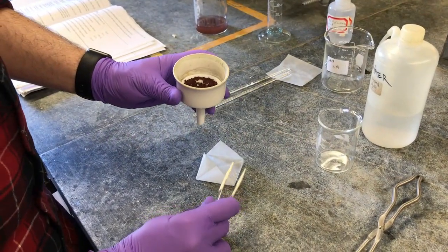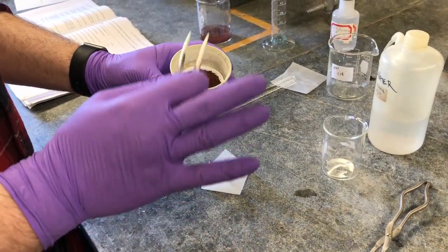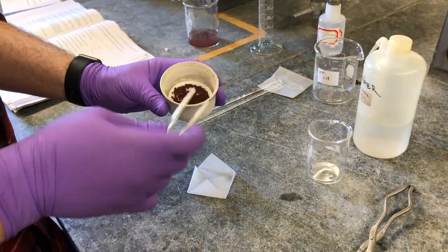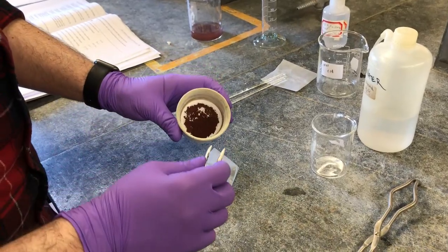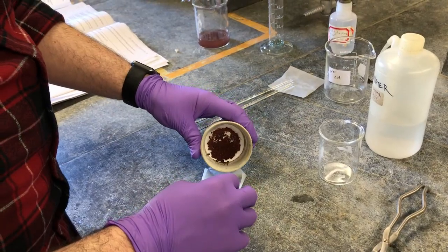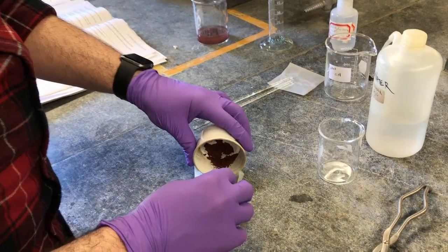All right, so we've let this dry on the aspirator for about 5 minutes. Now we took it off and we're going to carefully put this on the weighing paper.